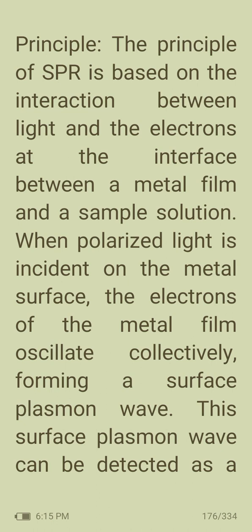There is an interaction between light and the electrons at the interface between a metal film and a sample solution. When polarized light is incident on a metal surface, the electrons of the metal film oscillate collectively.